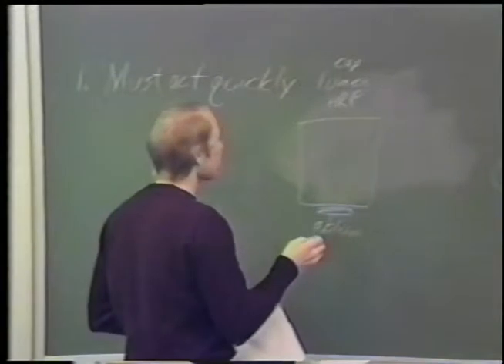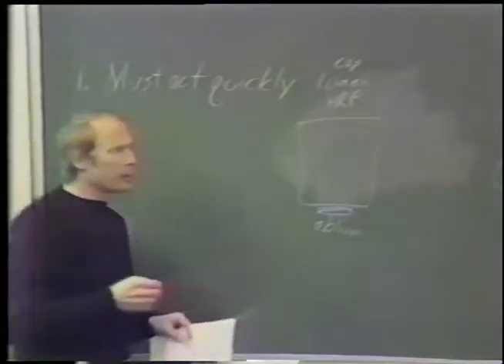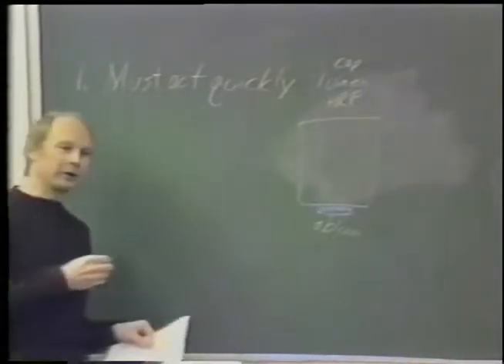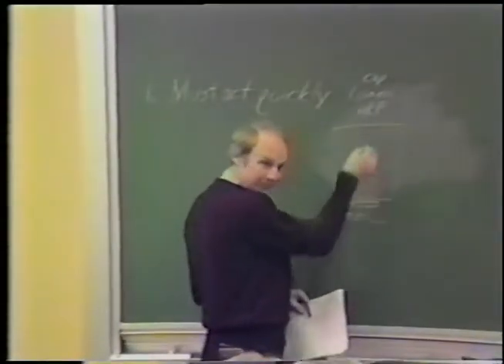It was over here when they examined the tissue after fixation, after processing. So they said, well, let's try adding the glutaraldehyde a little before we put in the HRP. So they put it in a second before, and the HRP was still over here. They put it in 2 or 3 seconds before, and the HRP still was on the other side of the cell by the time the cell was fixed.